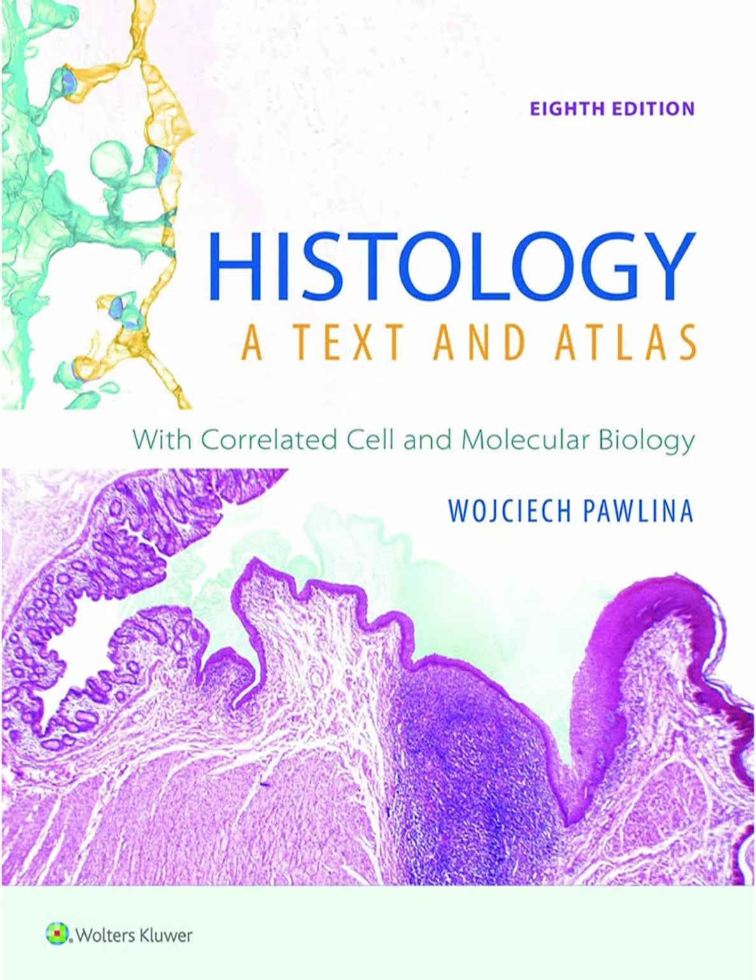H&E is fantastic for general structure, but it doesn't show everything. For example, routine processing with those organic solvents dissolves neutral lipids, fat droplets basically. They just wash away. Oh, so you can't see fat with standard H&E. Not easily, no. If we want to see those, we typically use frozen sections.